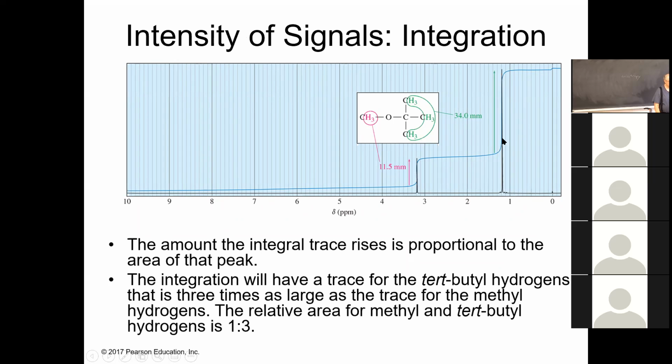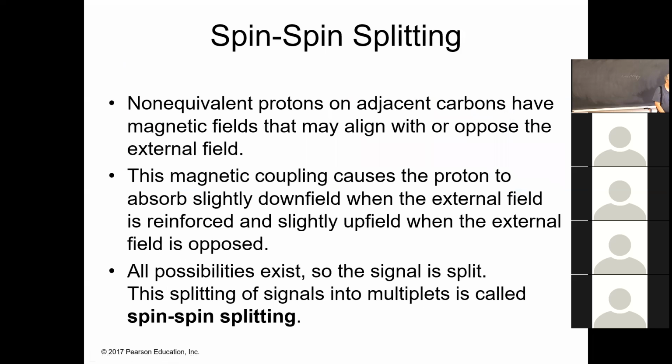Strictly speaking, it's not the height of the peak, but it is the area under the peak, which in calculus is called the integral. Okay, and NMR instruments can perform integrations. And so we'll have integrals in a ratio of 9:3 or 3:1 for these two peaks. Okay, that's important information. The integral can help us narrow down the possible structures.